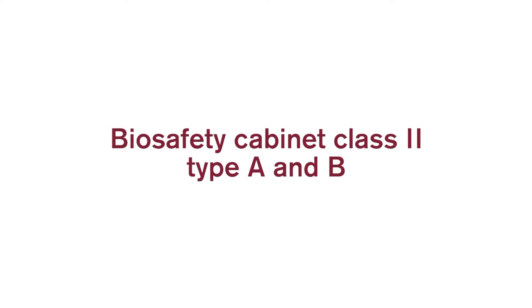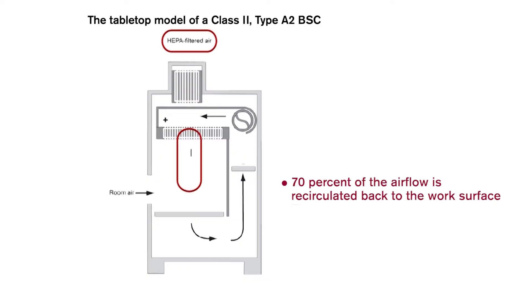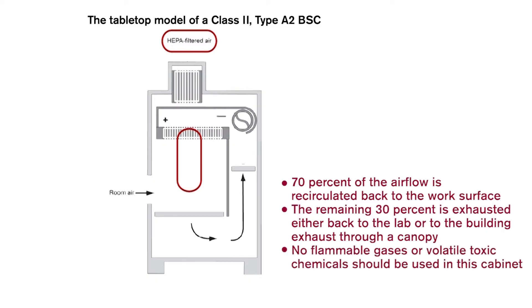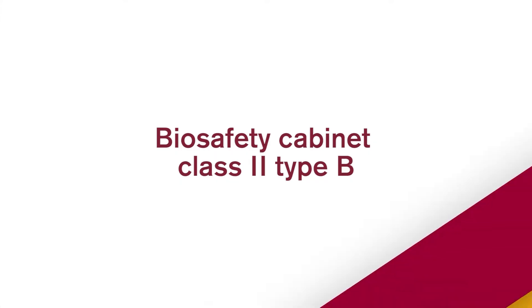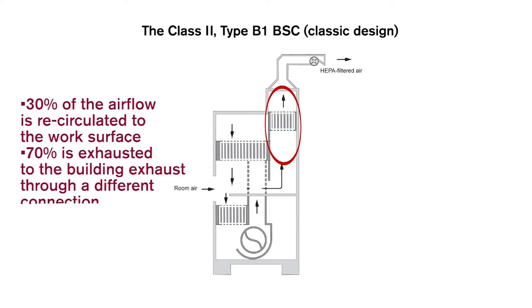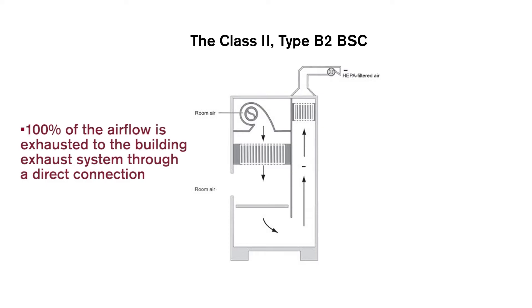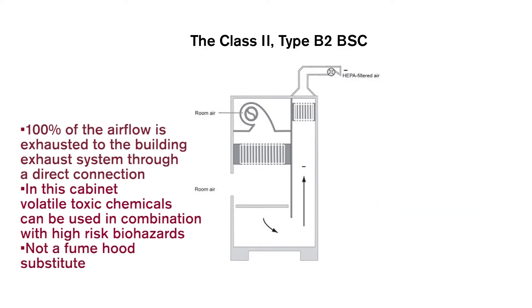There are two types of class 2 biosafety cabinets, A and B, depending on where the air is exhausted. In class 2 type A, 70% of the air flow is recirculated back to the work surface, and the remaining 30% is exhausted back to the lab or to the building exhaust through a canopy. No flammable gases or volatile toxic chemicals should be used in type A. In class 2 type B1, 30% is recirculated and 70% is exhausted to the building exhaust. In class 2 type B2, 100% of the air flow is exhausted to the building exhaust, and volatile toxic chemicals can be used in combination with high-risk biohazards. Always remember, it is not a substitute for a fume hood.